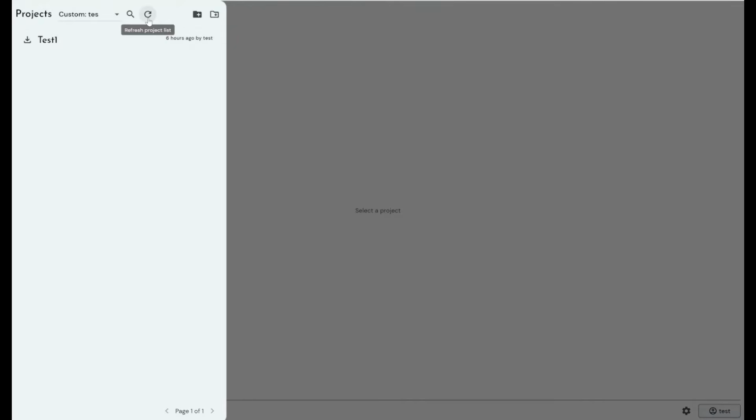And we can refresh the project list in case you've got 100 of these client apps on 100 different computers all around the lab. Someone may push a project and you just need to refresh your project list to grab that new project information on your copy of the client. So as I touched upon there, you can have many clients, hundreds, all connecting to a single server component, and it's what gives us the ability to have centralized project lists, audit trails, that kind of thing on the server component, which I went into in my previous video.